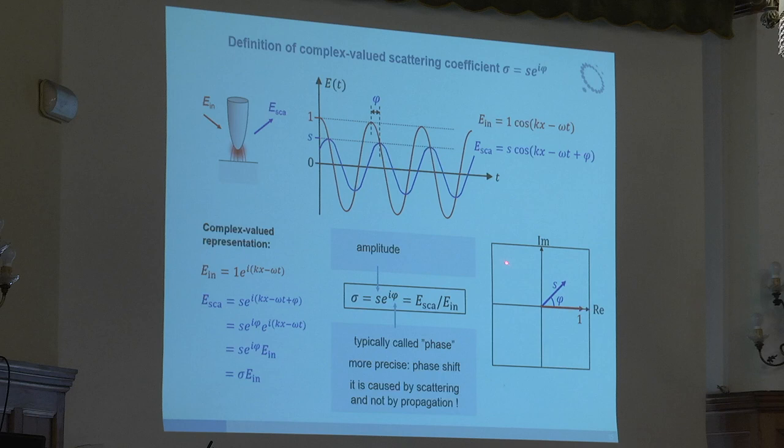That's another important thing. The sign of the phase leads to a lot of trouble, as we will see later on. We define in s-SNOM, if you have an absorption or something like this, then the phase shift is positive, but we will come back to this later on. You will also be able to see negative phase shifts, which can be very confusing, and there will be a separate talk on that.